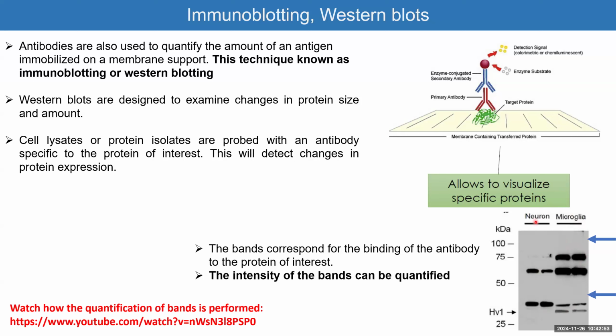Or you can say the drug is eliminating or downregulating a protein expression. If you look at this, it's already like all the scenarios you can draw, it looks like that. Now, the intensity of these bands is not only by eye. This is black and white. In this condition here, this is black and white, where there is almost no expression and there is a lot of expression here. But if you have a scenario like this guy here, you can't really get a conclusion.